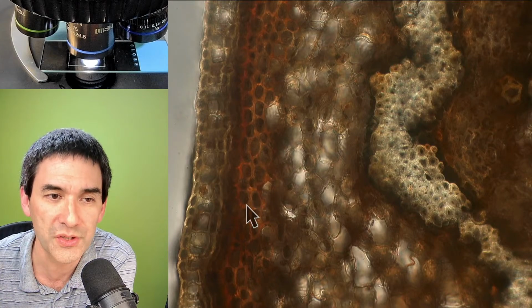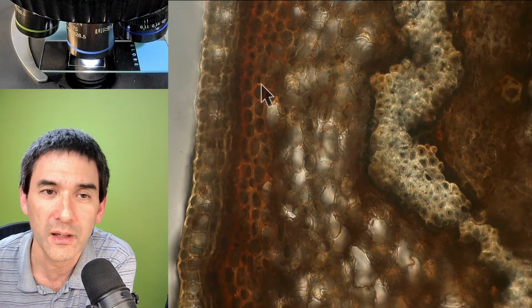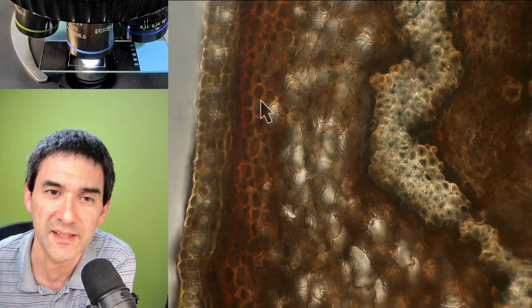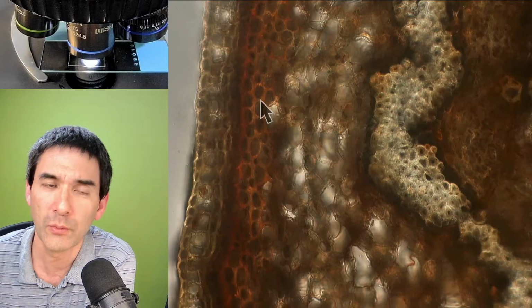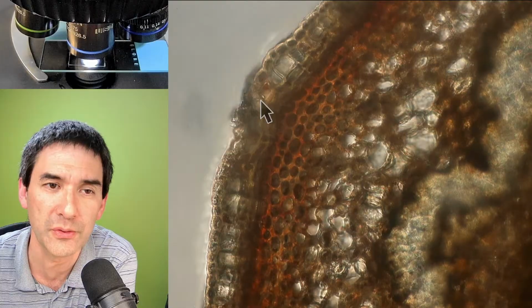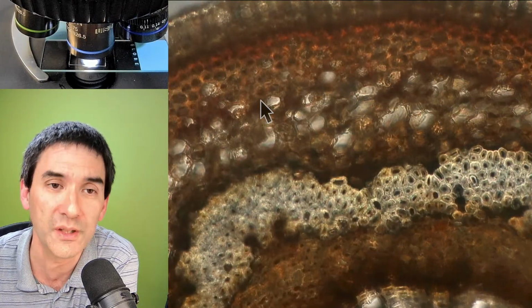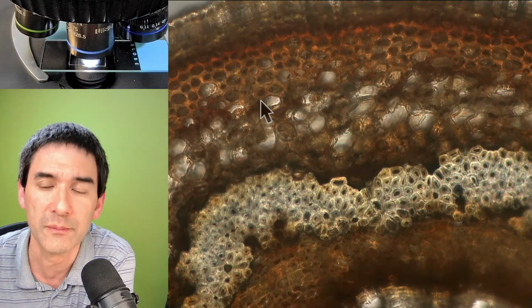So those cell walls are quite thick, and not only does that give a lot of strength, but there's also this lignin inside the cell wall. While we're not able to see the lignin itself, the fact that we can see the thickness of the cell walls already gives an indicator that it must be quite strong.